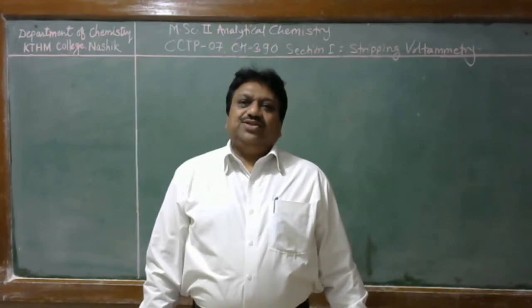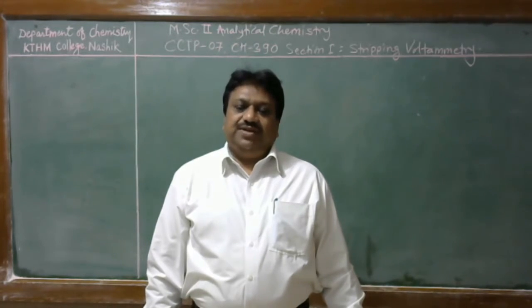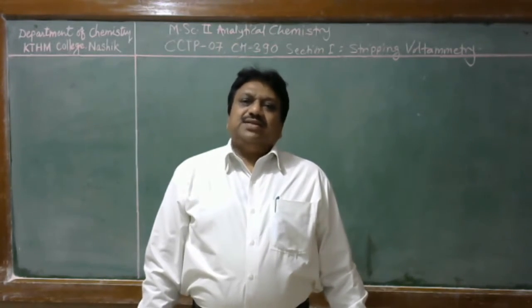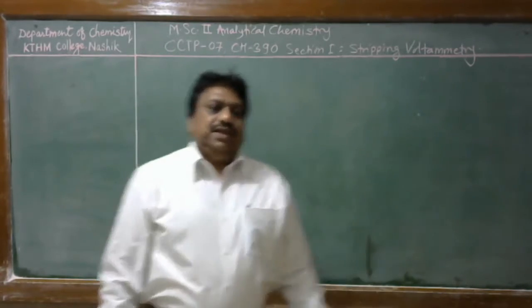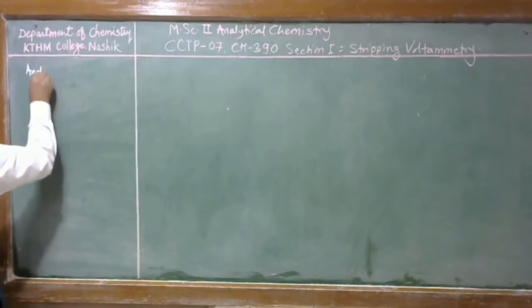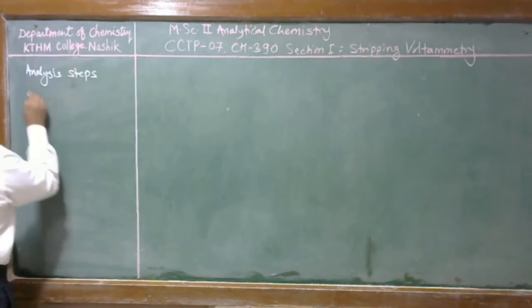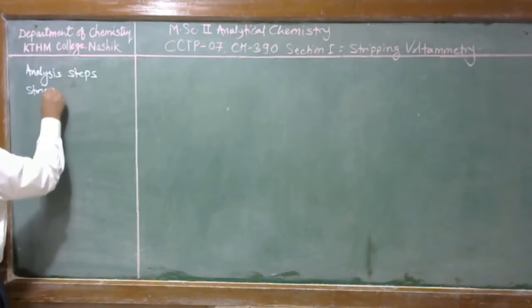Students, in today's lecture, we discuss some qualitative and quantitative applications of stripping voltammetry. In the previous lecture, we discussed the analysis steps involved in stripping voltammetry.